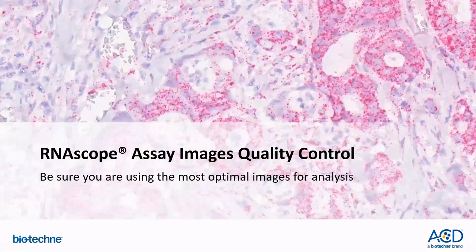Before moving on to the CellProfiler analysis workflow, it is essential for us to review the necessary attributes for an image to have before we can be confident in the image enough to move on with analysis. It is very important to be sure you are using the most optimal images for analysis.